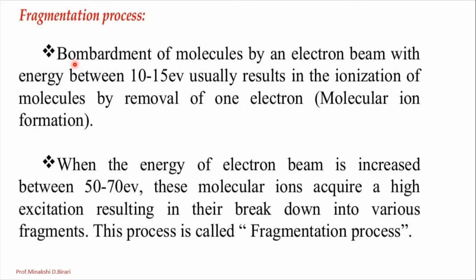So what is fragmentation? The fragmentation process is nothing but the cleavage of bonds. That means bond breaking. The bombardment of molecules by an electron beam with energy between 10 to 15 electron volt usually results in the ionization of molecules by removal of one electron, and that leads to the formation of a molecular ion.